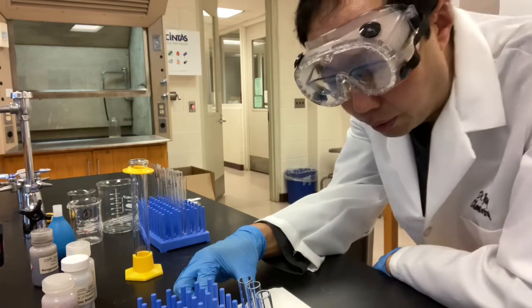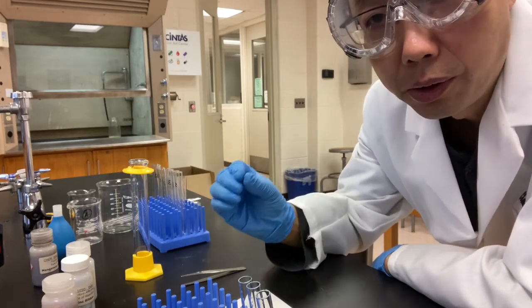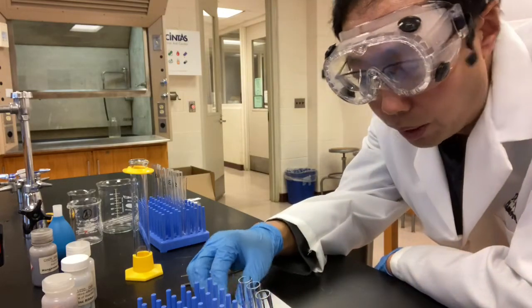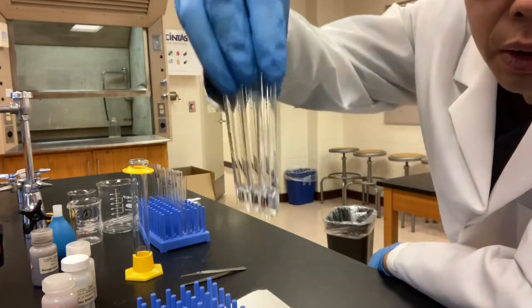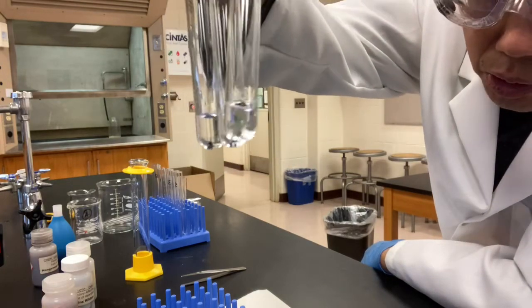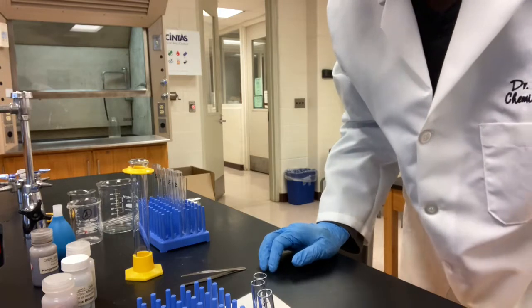Here is the second part. In the last section, we used different acids to react with the same magnesium metal, magnesium ribbon. Now in this part, we are going to use the same acid. I have put 1 ml of 6M hydrochloric acid into each of these 3 test tubes. To each of these test tubes, I'm going to add different metals.